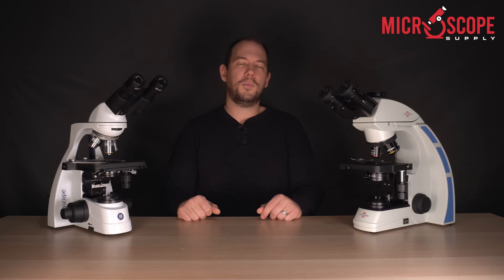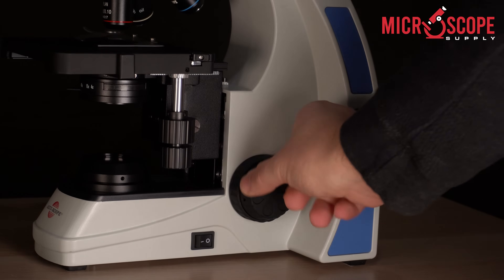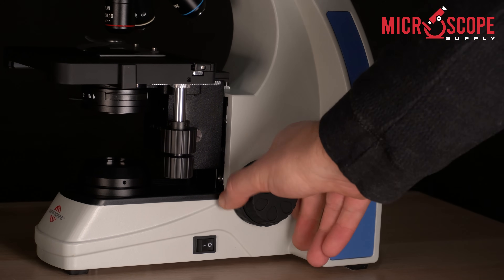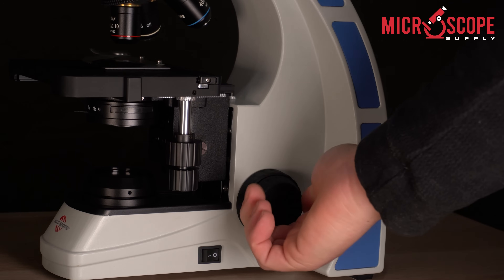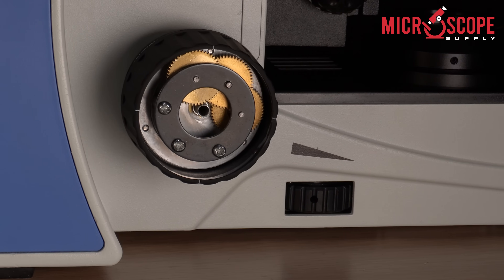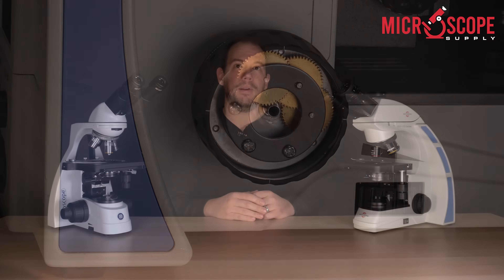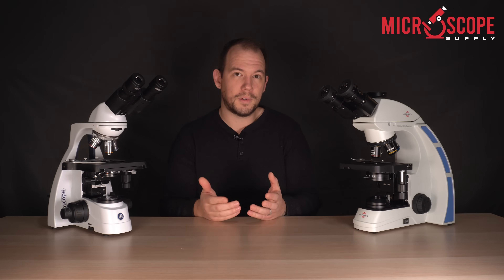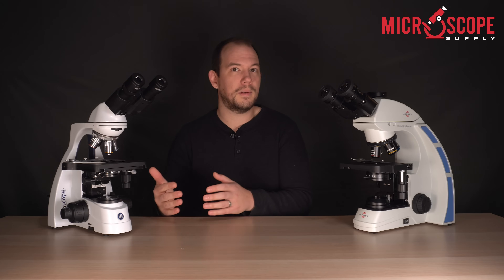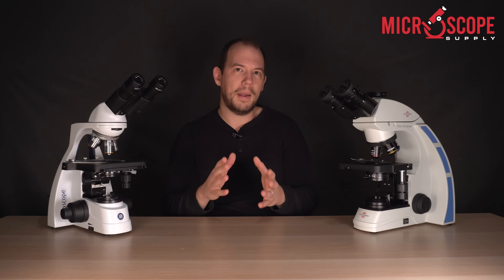The second material category is the material used for the fine and coarse focus assembly. You're constantly moving the fine and coarse focus on a microscope to focus your sample, so it stands to reason that a metal gear assembly would be preferred. Over time and after lots of use and abuse, plastic gears can fail, and if a gear does break it can be fairly complex to repair — you'll have to look for spare parts or reach out to somebody to do the repairs for you. Whenever possible, go with a metal gear assembly.